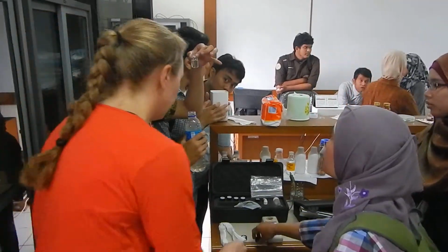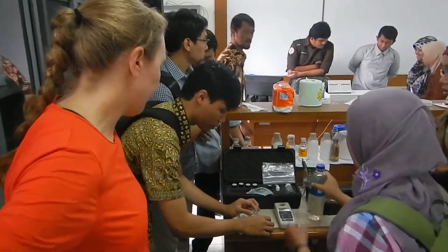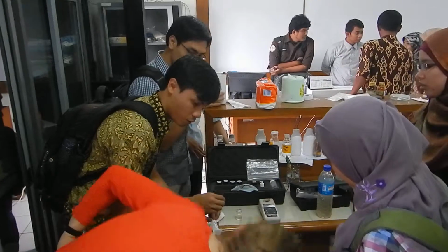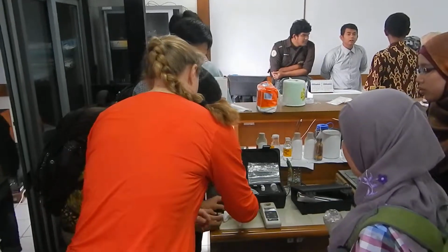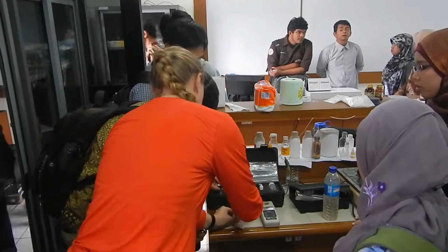Yep. All right. I'm going to guess my turbidity number. I'm going to guess 80. You can't change it after you see the smaller sample. All right. Now screw that in. These are chem wipes.